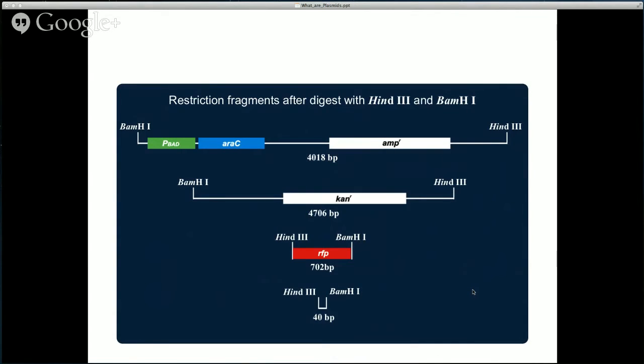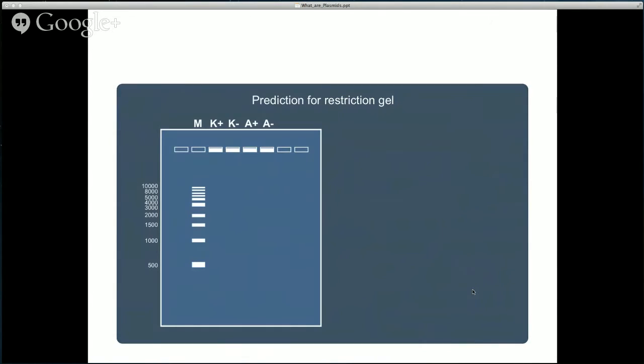How do we know that we've actually cut our DNA? We do an assay called DNA electrophoresis. Essentially, we're taking a gel, agarose. Remember agarose, those horrible math computations that I had you do in Lab 5? Agarose gel is what we use to do a DNA analysis. If you guys have ever seen CSI and they have those pictures of different bars and they're talking about genetics and you see the different lines on this graph, that is a gel electrophoresis, just like what I have here.